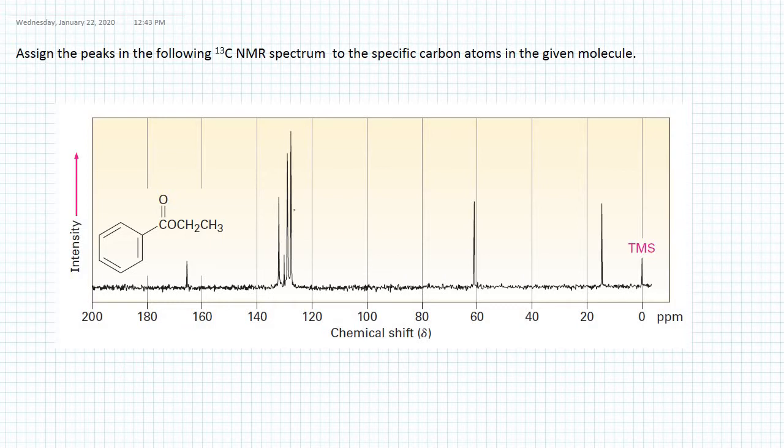Let's start. This molecule is an ester, and it has here an aromatic ring, a benzene ring, a carbonyl functionality, an ester group, and here the alkyl part of the ester. Okay, let's start labeling different carbons with letters. Let's start from this carbon. Let's say we have here a carbon of type A, and here we have a different carbon B. Here we have a carbonyl carbon C.